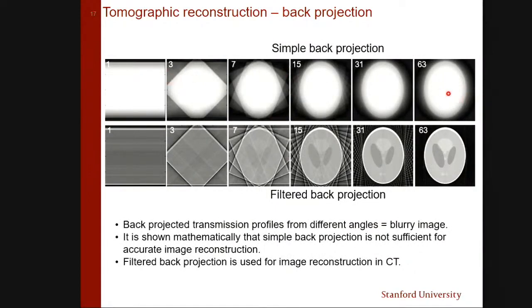It's just because everything happens in Fourier space. When you do this angular change, you go around some center point. At the very center, you have a very dense angular density, while at the outer space you have a sparser one, because of these spherical coordinates. That introduces artifacts. So instead, you use a high-pass filter. You filter out some frequencies, and then you end up with a nice reconstruction here. I don't want to go into details of how this is done, but generally this is what you see: you do back projection reconstruction using filtered back projection reconstruction, okay?